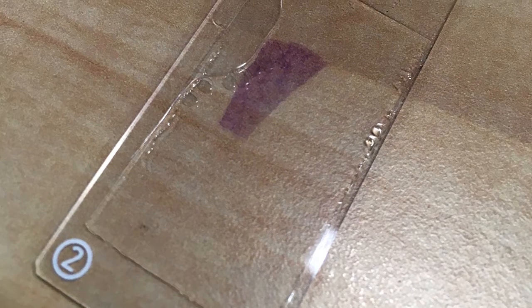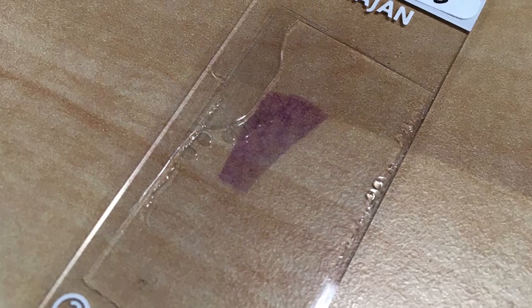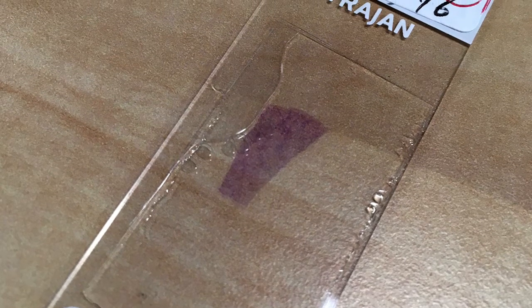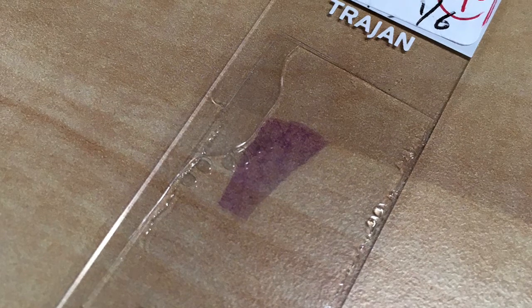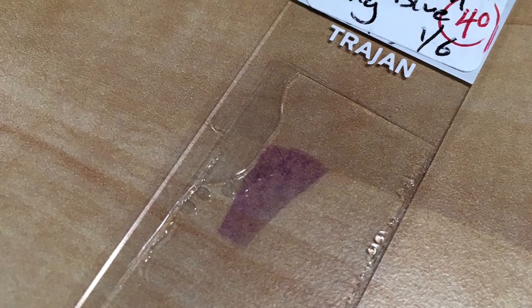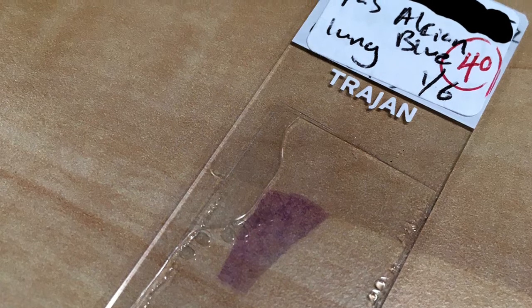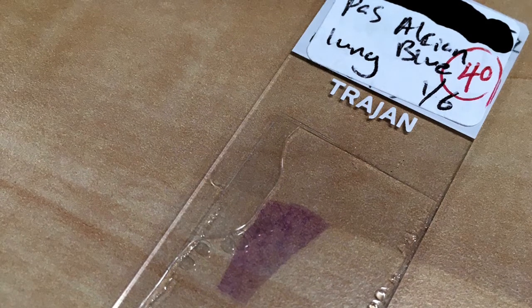Beginning with this first slide, you can observe towards the top left-hand corner that insufficient mounting media has been applied during cover slipping, and so that's resulted in this large air pocket being present, including a series of smaller bubbles that are covering the specimen itself. Because of that, you can't observe sufficient detail within the specimen, and so this slide has little to no diagnostic value. That, combined with the quality of the stain that's been applied, has resulted in a score of 40%.